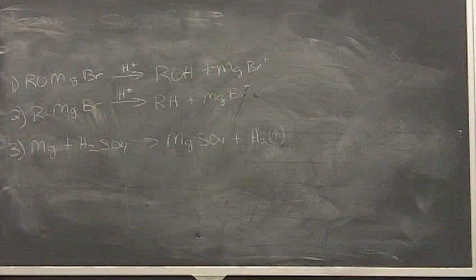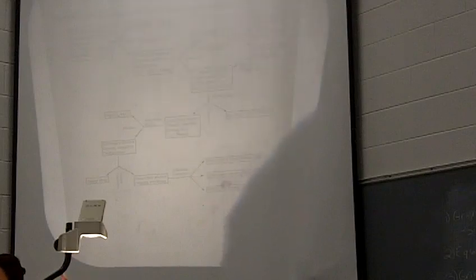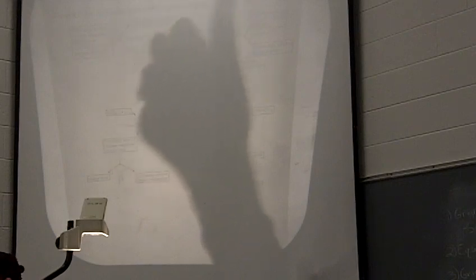After you've added all your sulfuric acid, you're going to want to look at your mixture. If you have a lot of magnesium, you potentially want to take on filtering that magnesium off with glass wool, because otherwise you're going to have to wait for it to finish reacting before you go on to the next step, okay? So it may be easier to filter this mixture with glass wool and then go on to the next step. If after you've added your sulfuric acid you're thinking you're going to need to filter, I would talk to your lab prof and see what they say, okay?